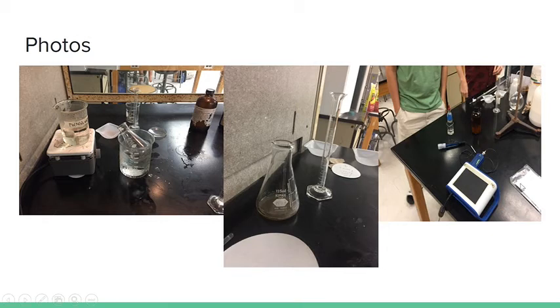Here is the pH probe that we used to measure the pH of the pharmaceutical aspirin against this lab-synthesized acetylsalicylic acid. It's connected to a Spark device here. Acetylsalicylic acid is a weak acid and as such only dissociates to a small extent; it has a very small Ka. So 0.3 grams of acetylsalicylic acid is soluble in 100 milliliters of water.